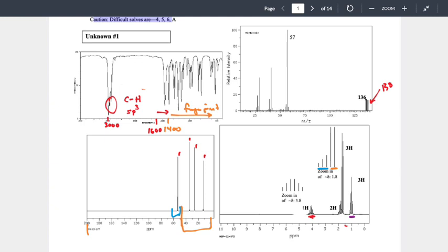That's it for my interpretation, so I now move to the integration. The integration is the area underneath the curve. So we can go back to our spectra and ask, where does our spectra give us information about the area underneath the curve? There's a variety of places to do it, and I'll show you a couple here. The first case is exactly as it's shown on this plot.